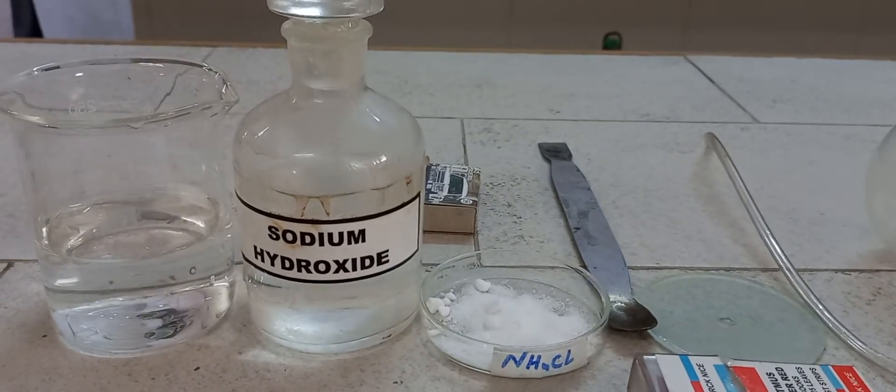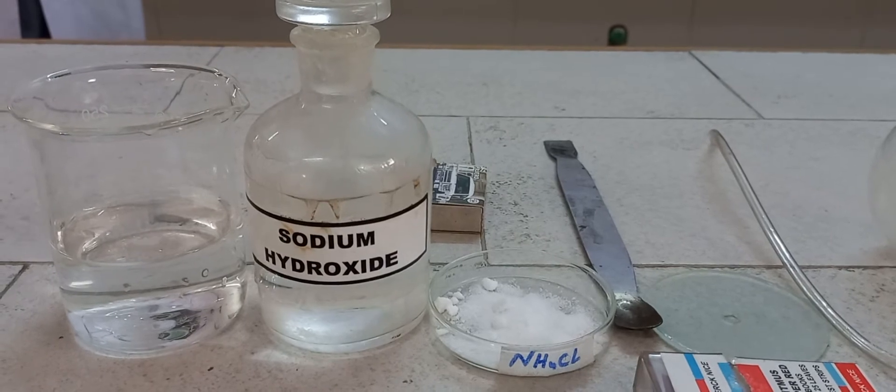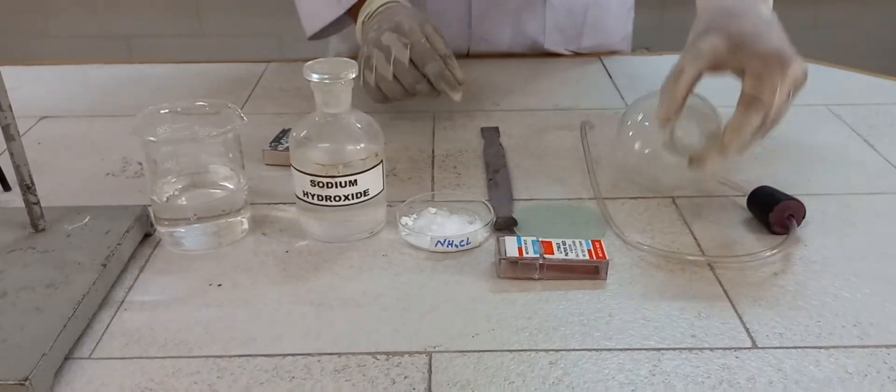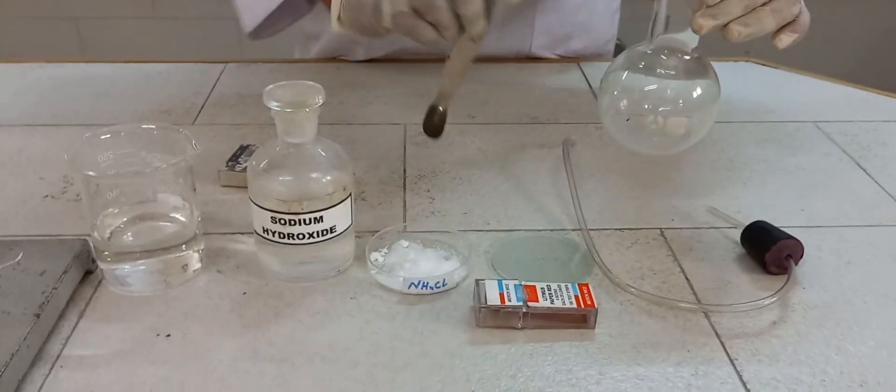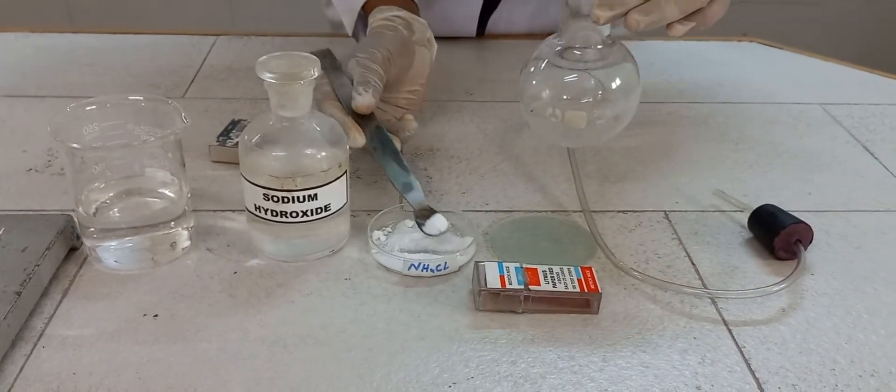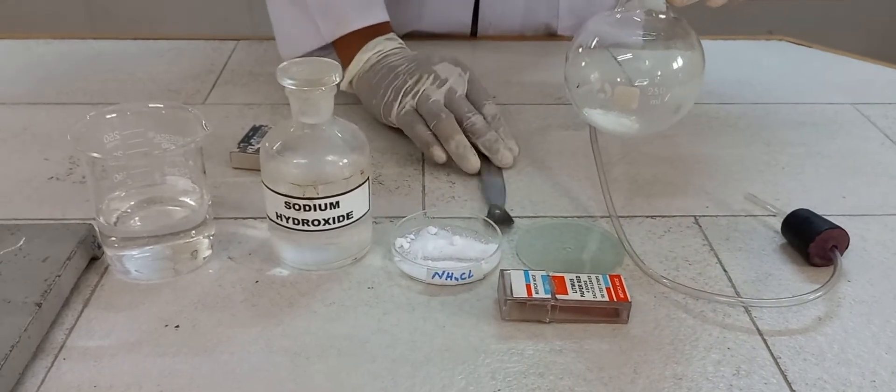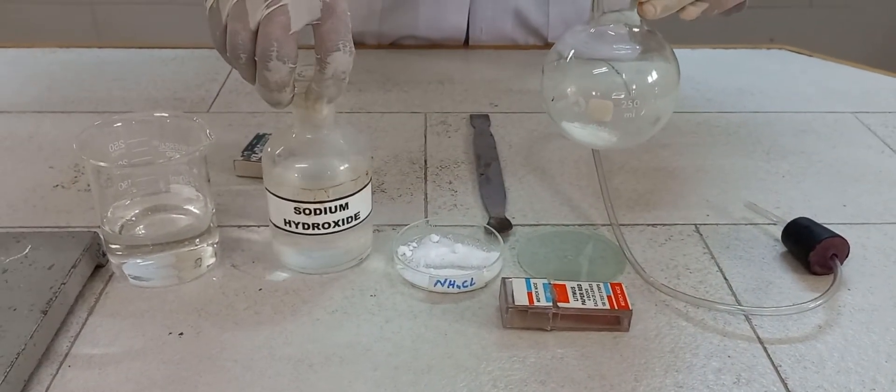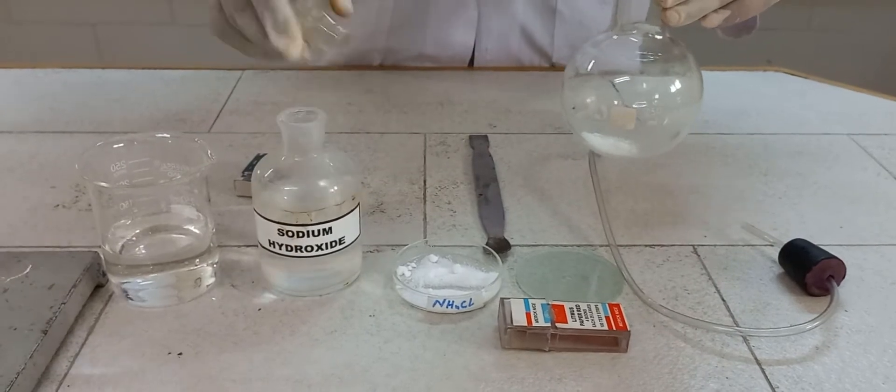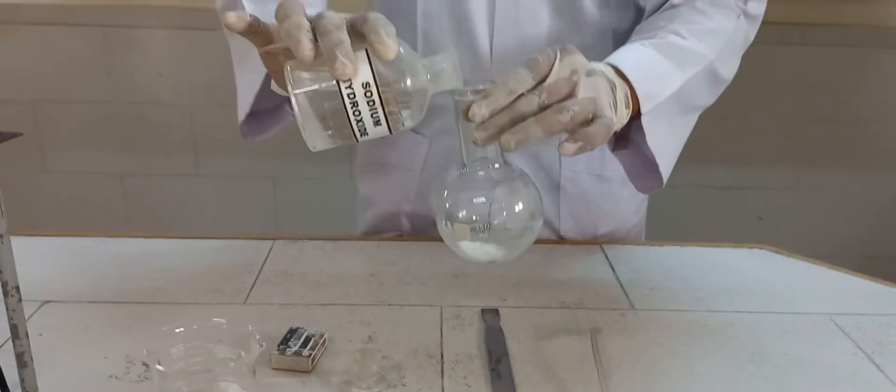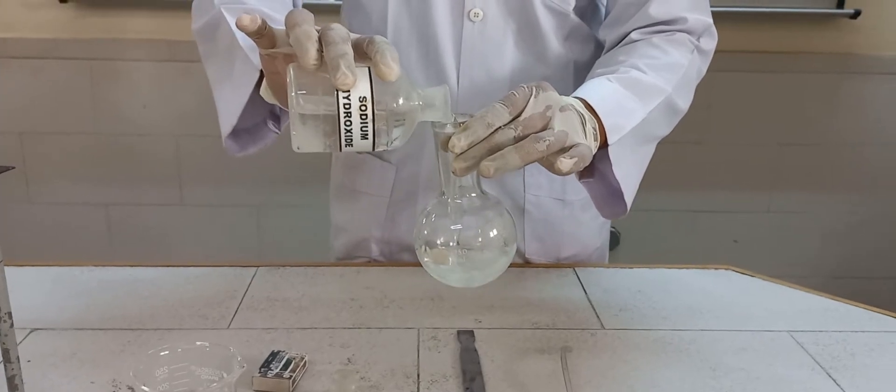Let's start with the experiment. Preparation of ammonia gas: we are taking a little bit of ammonium chloride in a round bottom flask. Why are we taking a round bottom flask? The reason is we have to warm it, and for the uniform heating we always do it in the round bottom flask. We are adding sodium hydroxide to it and the reaction has started.